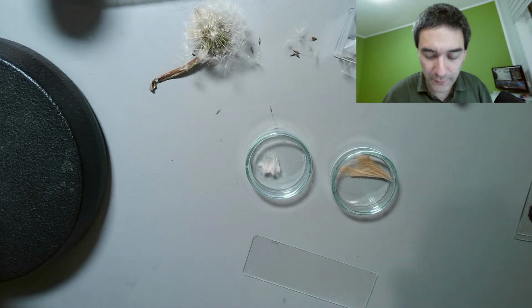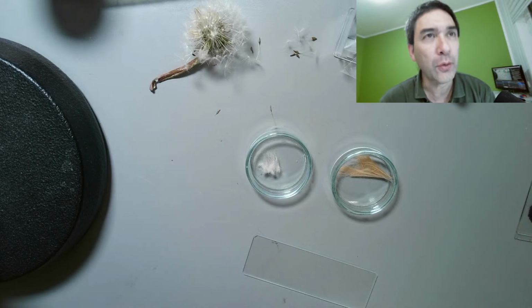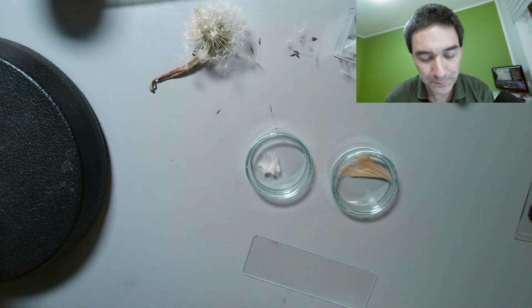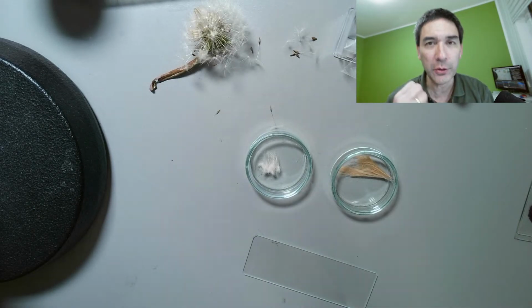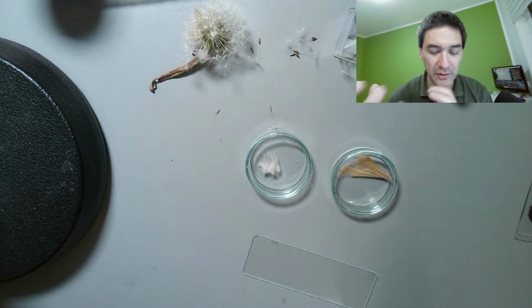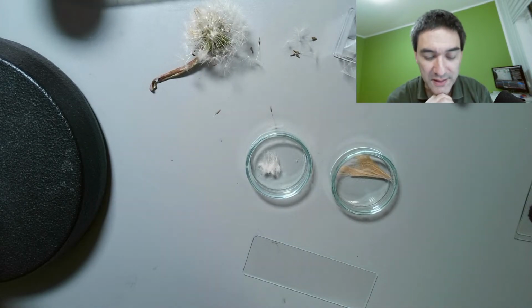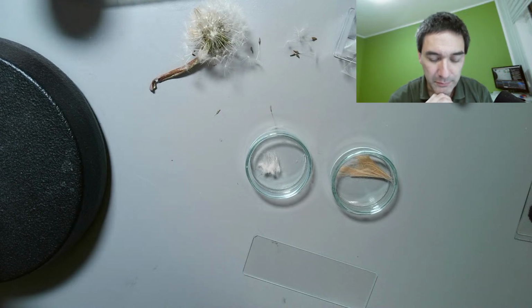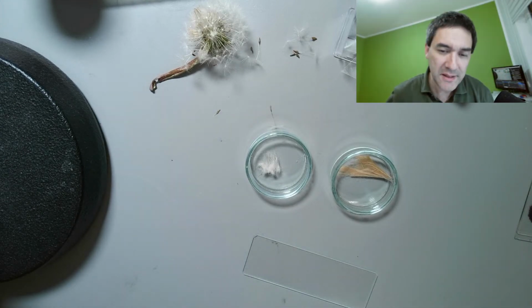And here we have the following issue: hair, of course, is there to protect the animal from water, right? So it's greasy. If I add water on top, it's going to make a lot of air bubbles because the greasy fur and the water do not like to mix.